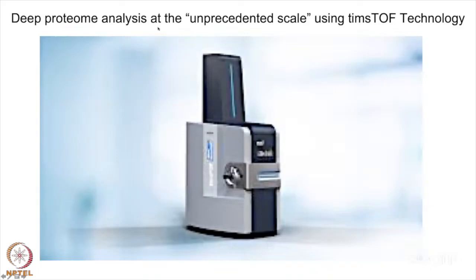Typically in proteomics, our goal has been to first get as many proteins as possible from a given sample. Using different workflows from DDA to DIA, what we have been trying to achieve was around 5,000 proteins from a typical cell line sample. But with this new technology, we have reached almost 8,000 plus proteins very easily, and group analysis even crosses 10,000 plus proteins. This is a wonderful incremental change we could observe using the 4D omics technology of the timsTOF. So I request Dr. Argya now to show the timsTOF instrument and explain about it.